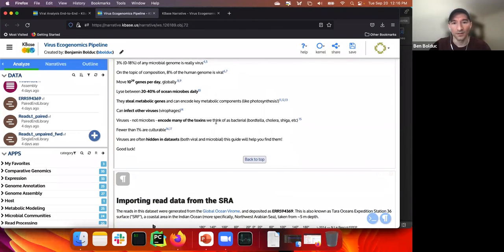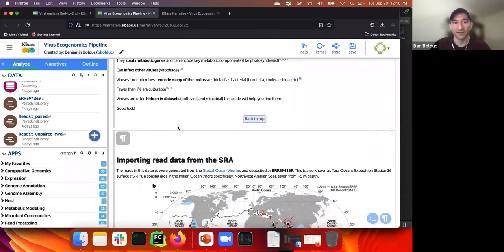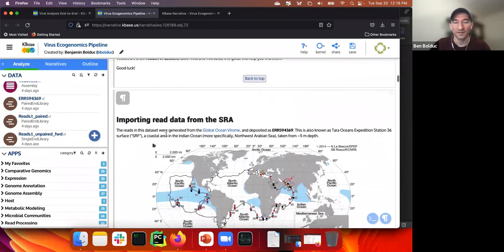And so there's a lot more information you add to this, the context. If you're running an analysis and you want to publish it in Science or Nature or something, you can create this protocol with your real data, your actual data, and everything will be available to every single person when you're publishing that. The same can be said for Cyverse, but it's going to be in a lot of different steps, and you can't use one URL for Cyverse, unlike you can with KBase.